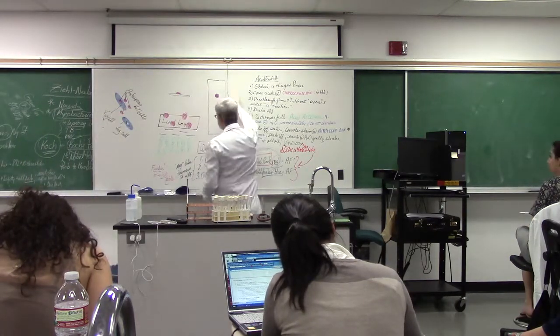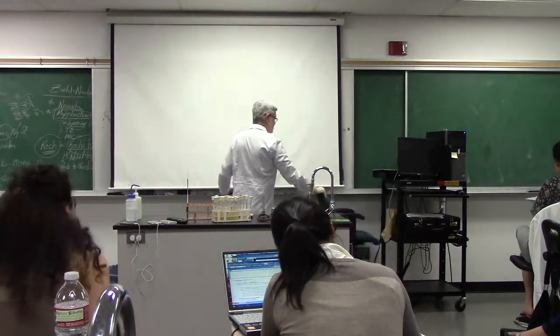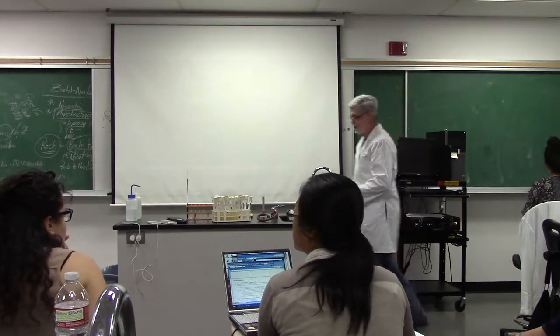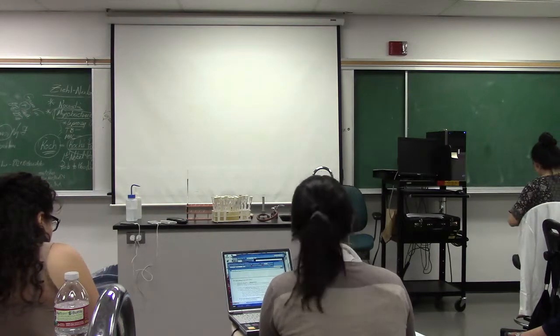Okay, so I want to show you a few things, a few pictures, and then I'll demonstrate this, and then we will have a little quiz and do it. And I just want to show you mostly the problem stains.